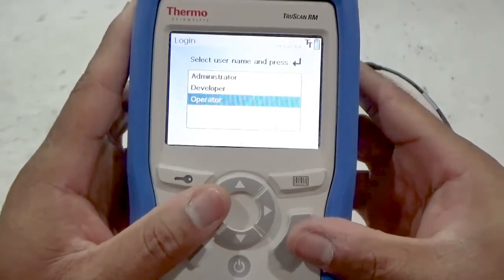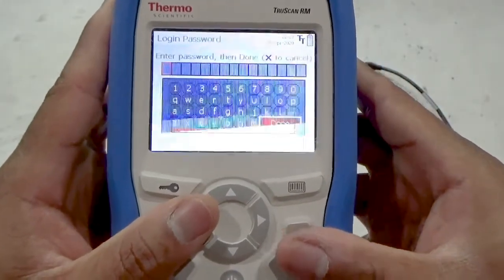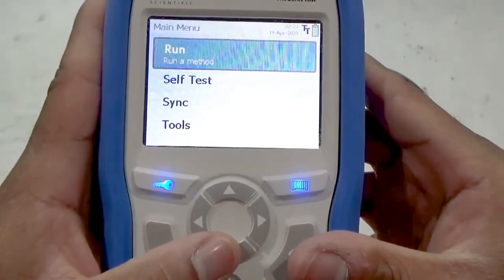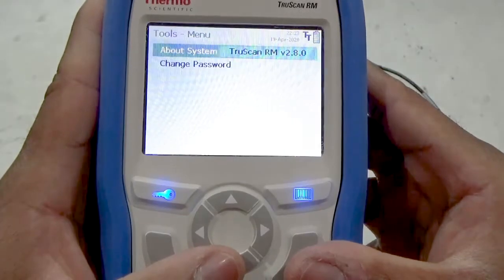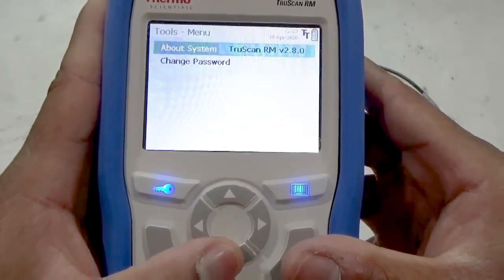For this demonstration, I will utilize simple passwords for each user type. Now I will log in as an operator. The operator may run a sample to collect a data record, perform the daily self-test, perform a data sync, and access the tools menu for utilities and settings. The tools menu for the operator is limited to seeing information about the system and changing their password.